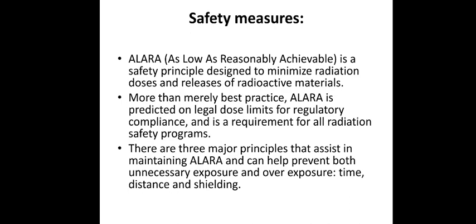That is the principle. So you are using them because they are useful. You can detect the presence of chemicals, you can localize the molecules, you can quantify them. So the technique is useful. But at the same time, there are also side effects. That's why use it as low as reasonably achievable. If you can achieve the same result with a lower concentration, then why go for a higher concentration? That is the principle of safety measures. So this is one of the best practices actually.